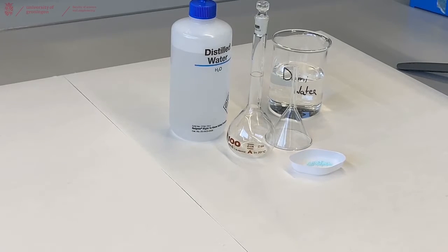Hello and welcome to this video about volumetric glassware. Volumetric glassware is used to make a solution of a compound in known concentration with very high precision.